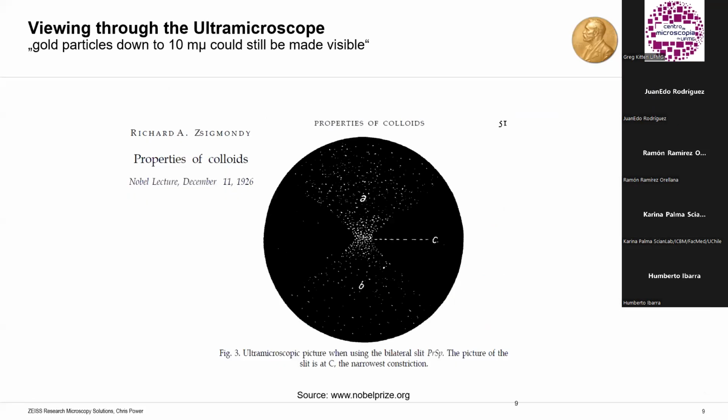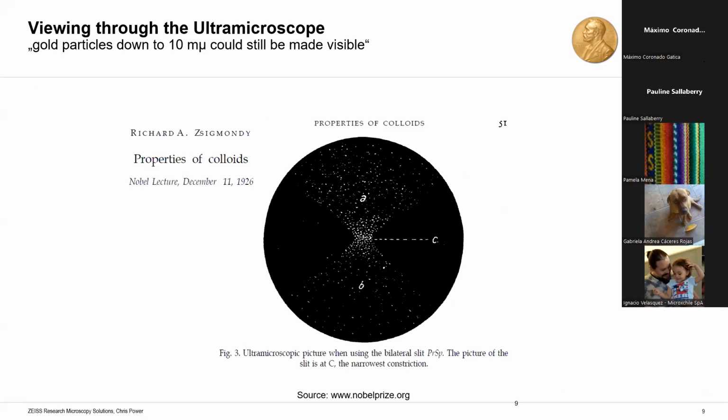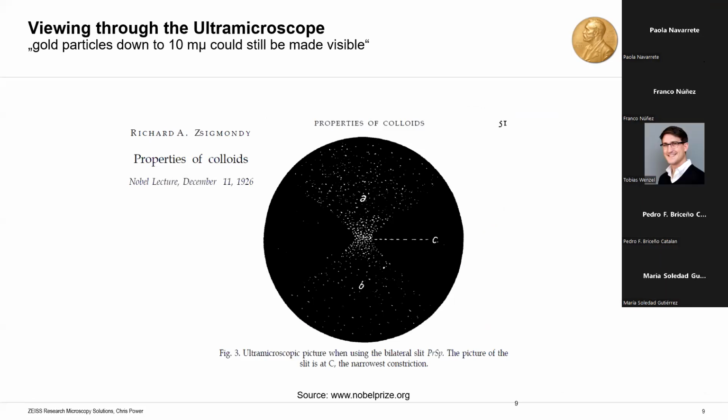And I just show one image from that microscope back in 1926, looking at colloids. But that, whilst interesting and Nobel Prize is great, wasn't the main drive that made light sheet what it is today. But back on those early systems, I mentioned resolution, magnification, and contrast. They had magnification from the microscope, they had contrast from the 90 degrees, and they wanted to improve resolution.